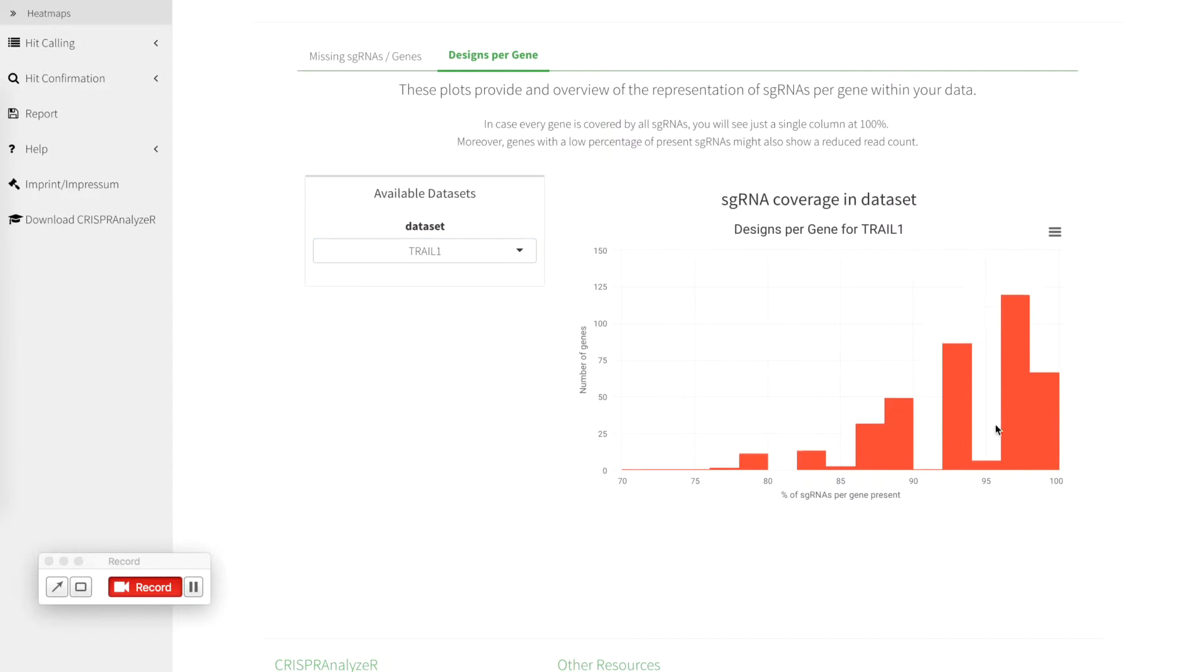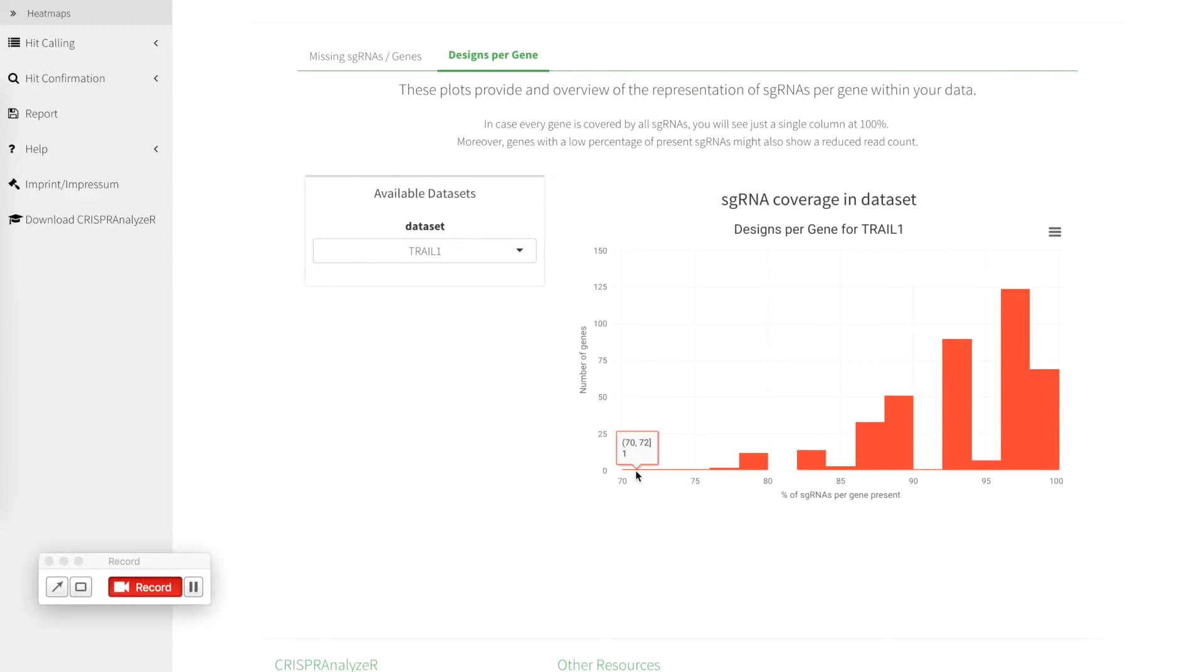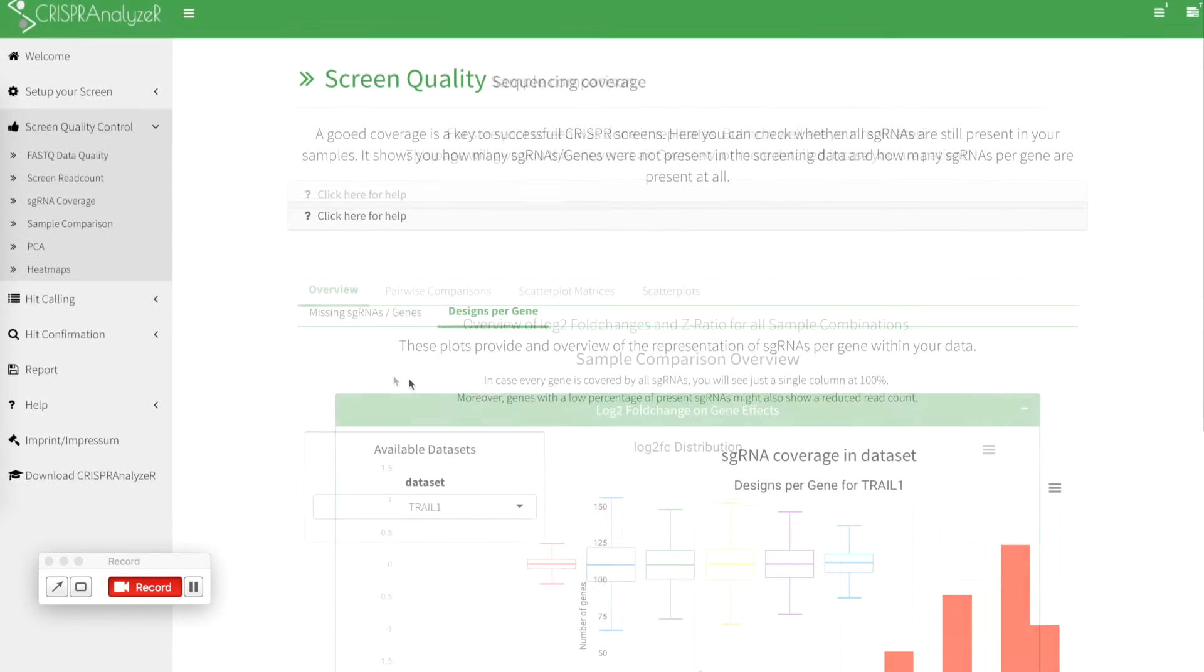If you look for a trial treatment data set it goes a bit further so only 69 genes have nearly 100 percent of all sgRNAs whereas in here 12 genes only show 78 to 80 percent of sgRNAs present and there is even one gene that just has 70 to 72 percent of all sgRNAs present in the data set.